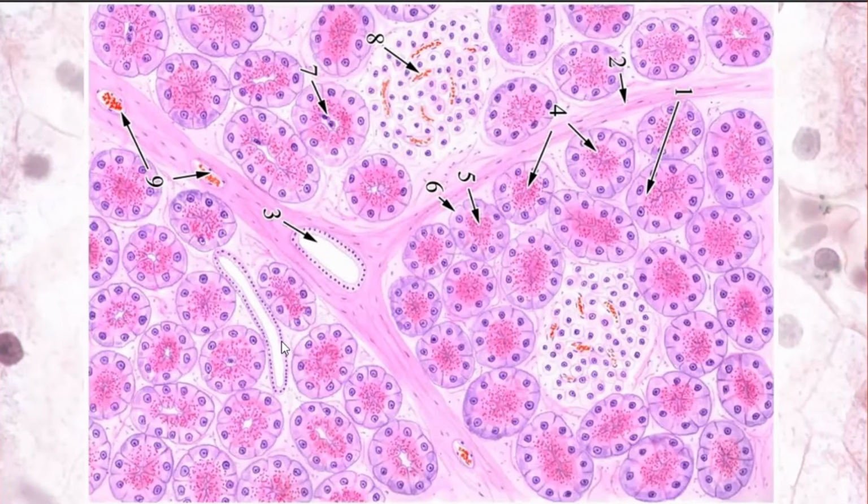Their epithelium is simple, and please note that pancreas and also liver are glands of endodermal origin, so their ducts are always lined with simple epithelium. Salivary glands have stratified epithelium in some ducts, especially in big ducts, and it's characteristic for the glands which have ectodermal origin. But those glands which derive from endoderm always have simple epithelium in the ducts.